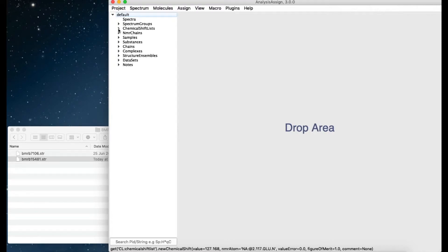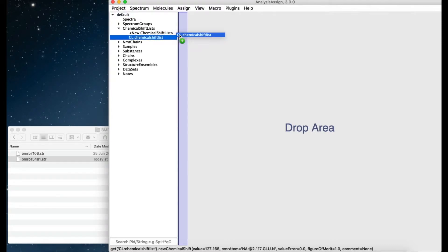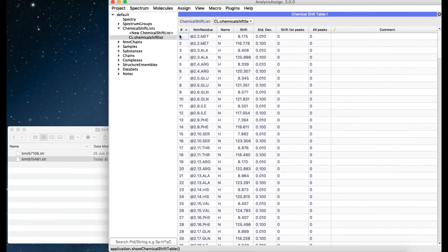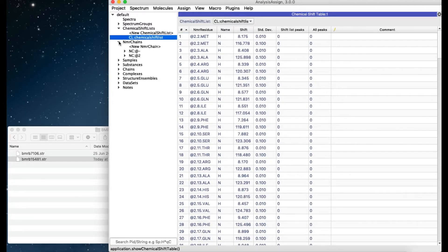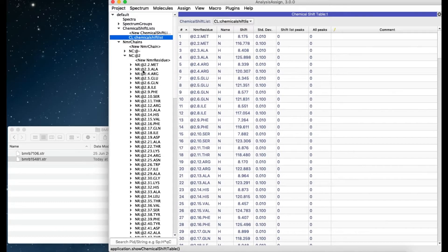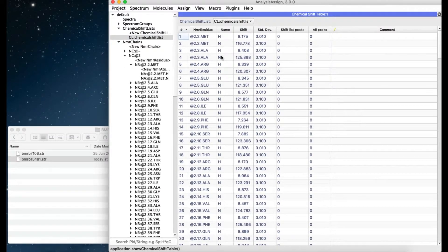You can now see under Chemical Shift List that it now contains the imported BMRB Chemical Shift List, and a new NMR chain has been created containing all the NMR atoms that are in this Chemical Shift List.